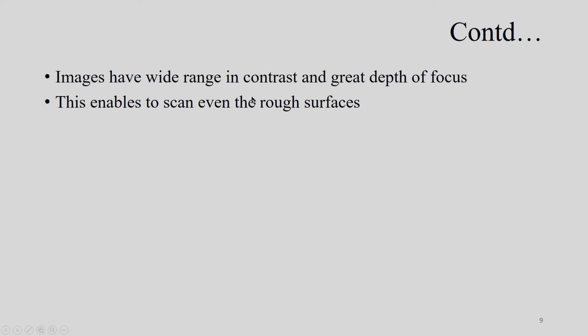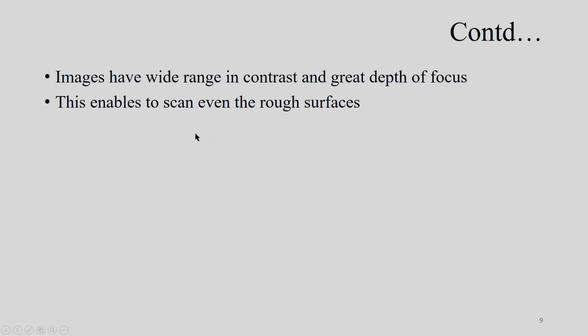So, these images have a wide range in the contrast and great depth of focus. It means it enables us to scan even surfaces with large roughness, which cannot be analyzed using atomic force microscopy, or you can say scanning tunneling microscopy. So, because of these features, even if you have roughness in the range of, let us say, micrometer rough surface, we can analyze using the SEM.